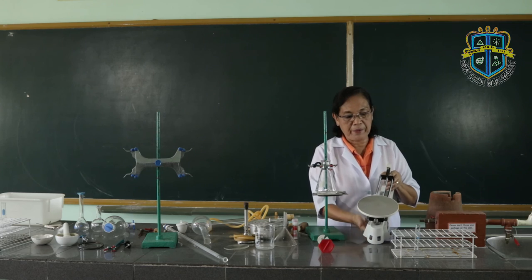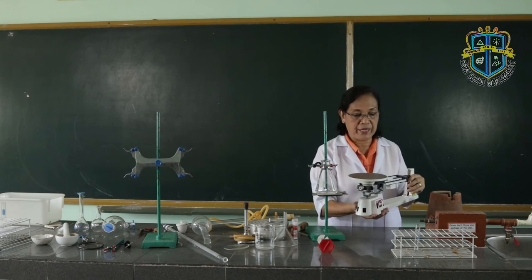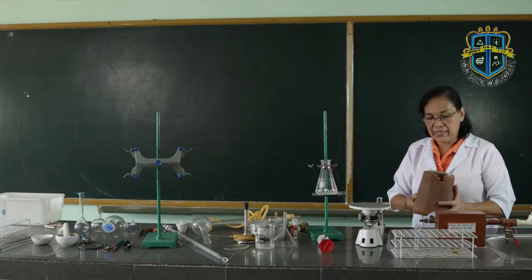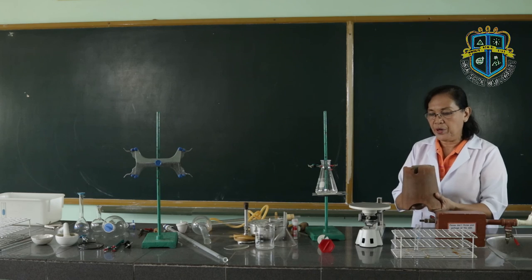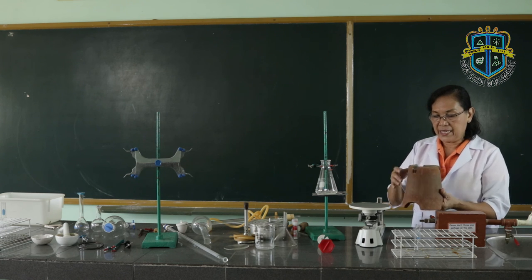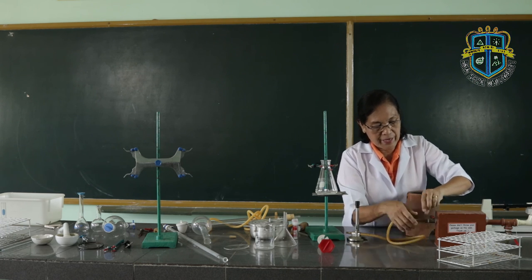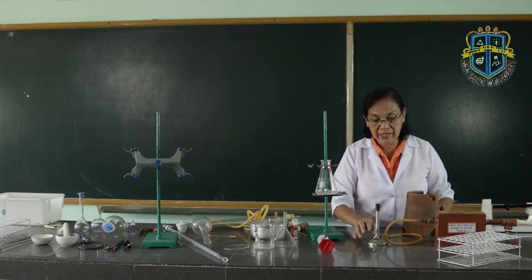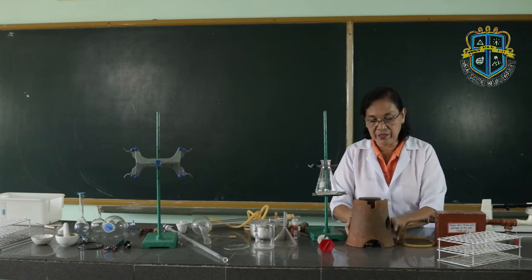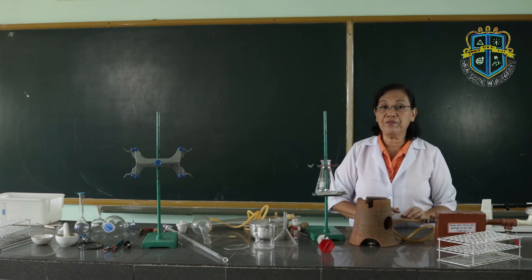This is the triple beam balance. The triple beam balance is used to measure or determine the mass of an object. And this is the clay shield. The clay shield is used to support vessels or containers when heating. When you are going to heat something using the Bunsen burner, connect the rubber tubing to the gas cup, then place the clay shield over the Bunsen burner to shield the flame from being blown off by the wind.